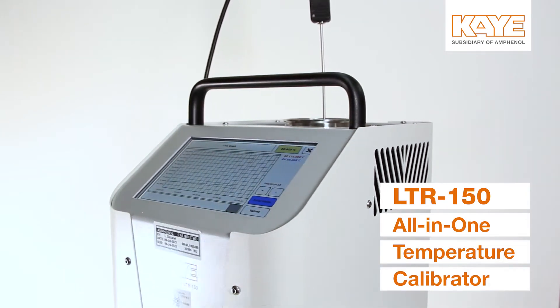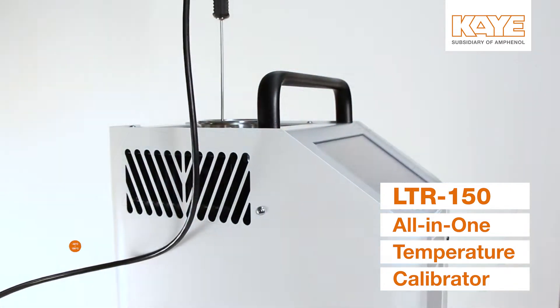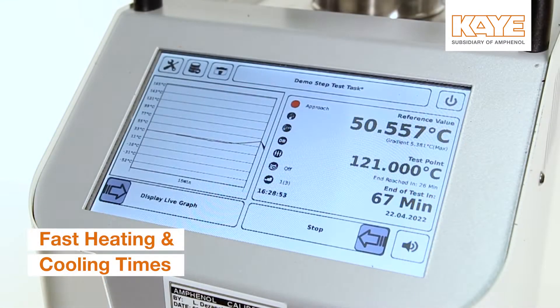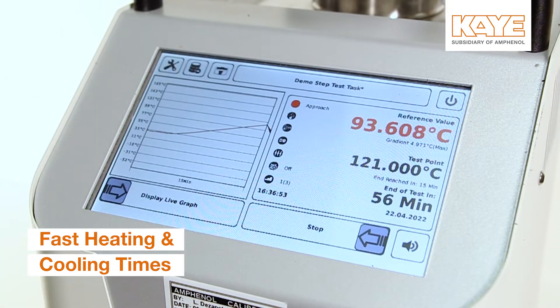The LTR-150 can be used for all your temperature calibration and verification needs from minus 30°C to 150°C. The calibrator's improved heating and cooling times provide more efficient calibrations.